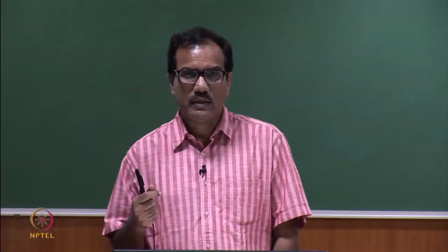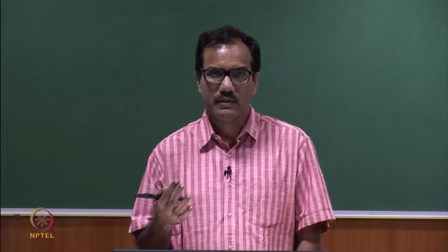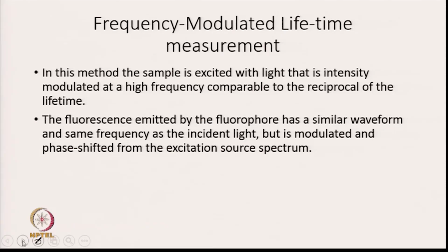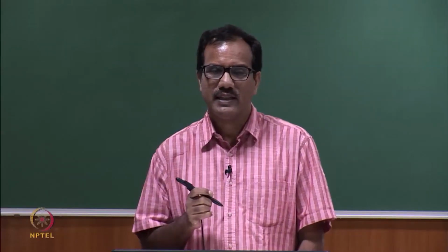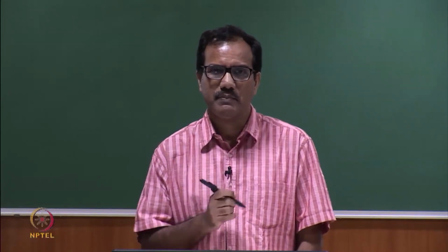Now, the second way of measuring lifetime is by using the frequency modulated lifetime technique. What you do in this is the sample is excited with light that is intensity modulated at a high frequency, comparable to the reciprocal of the lifetime.